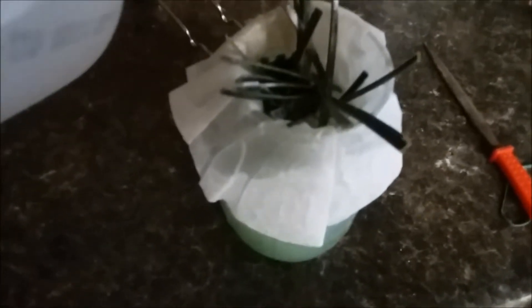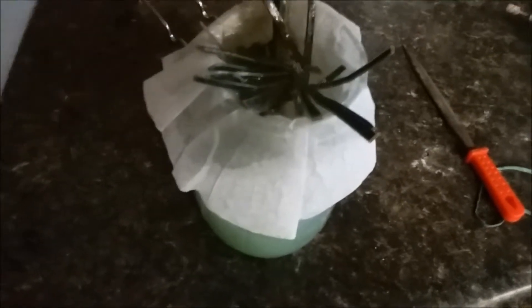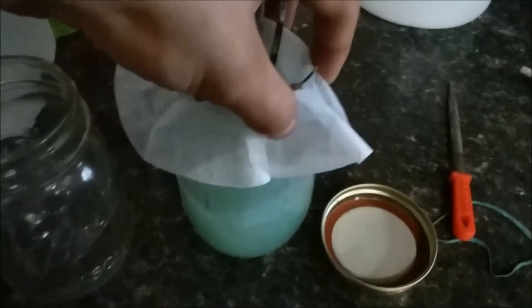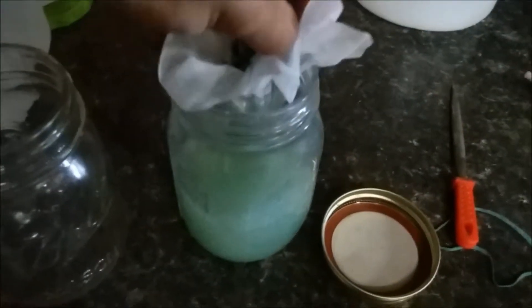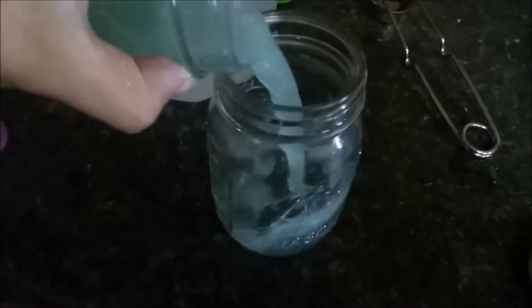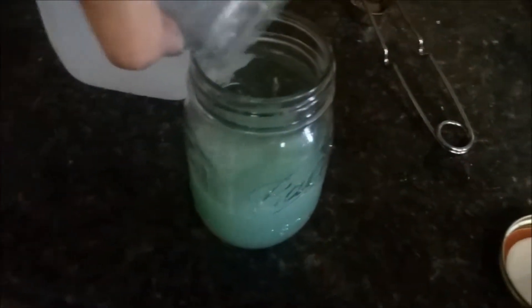Wash off most of the pieces of PCB left in here. Move the excess fluids to this jar — we'll just set that there carefully and pour this stuff in. Finally have everything filtered out and all the pieces of PCB have been rinsed and then removed.